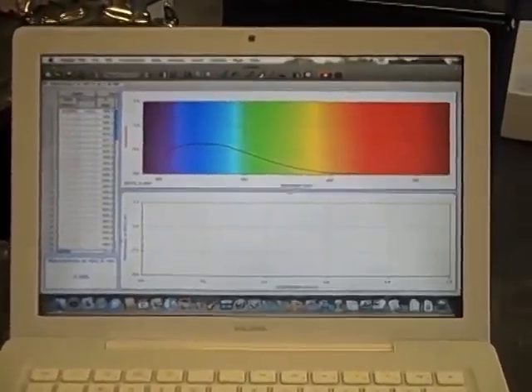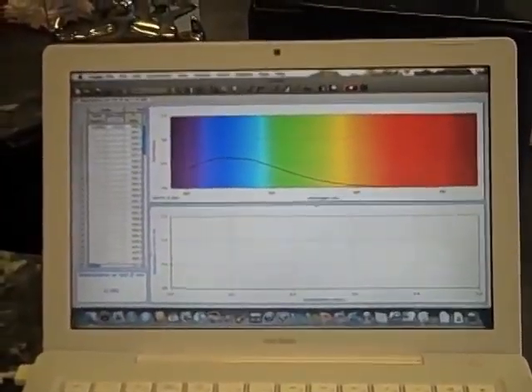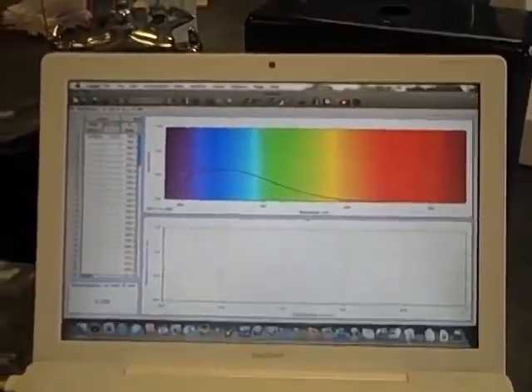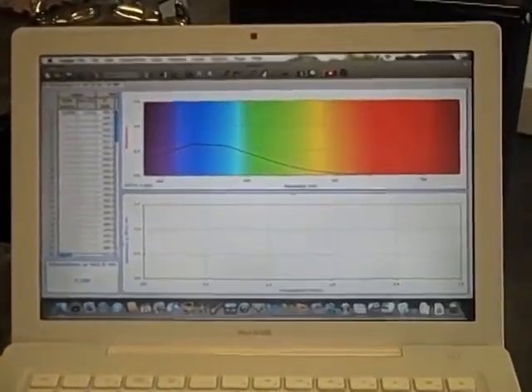So that fits with what we said about the absorption being higher for a more concentrated solution. Now, I notice that when we were looking at these, we can kind of eyeball the unknown too, and guess where we expect it might be, but we can't get an exact number unless we use this SpectroViz, right? Yeah, because you can tell that an unknown is between 2 colors, but you can't see that it's exactly halfway between these 2.